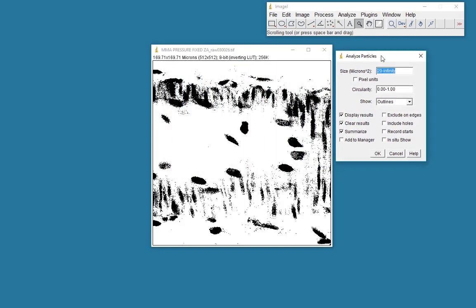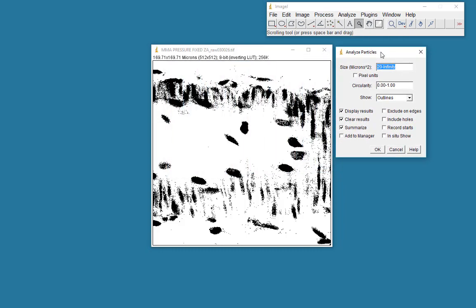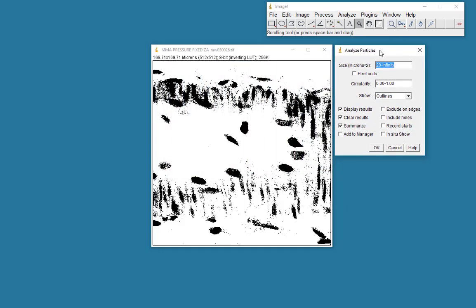Now in this window here, it offers me the opportunity to classify which size of objects I want to count. Now I don't want any objects which are less than 20 microns squared. Because these would just be small points, small individual pixels that you can perhaps see in the image here.